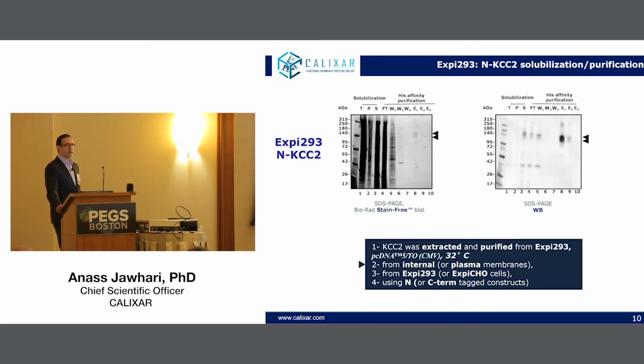Now, okay, it's great. You can express it and solubilize it. But are we able to purify it? Indeed, focusing only on this construct, we could purify it.